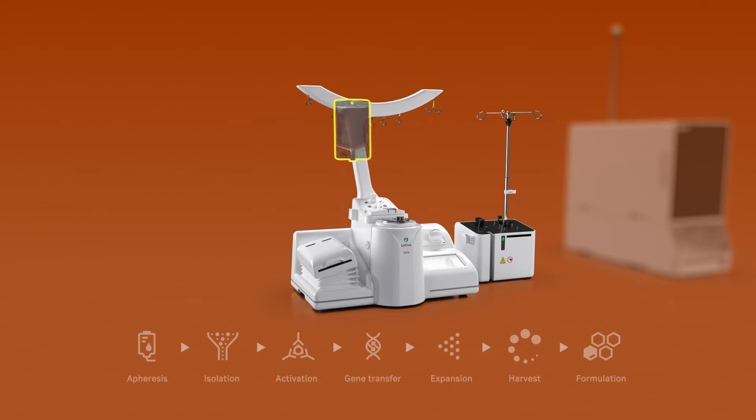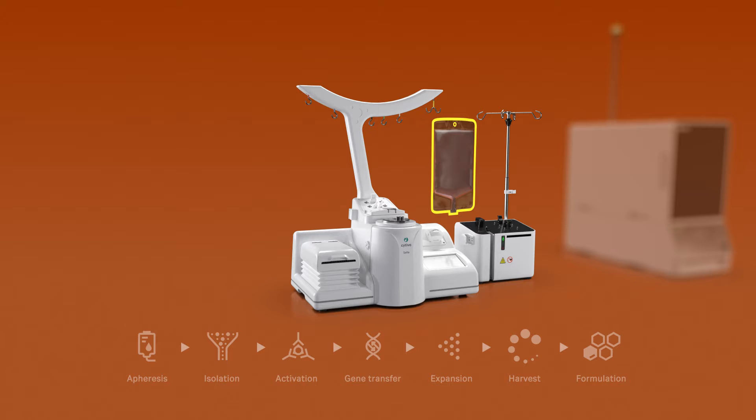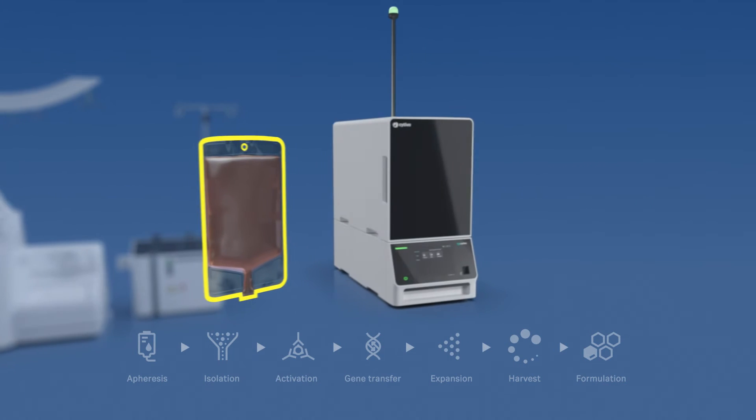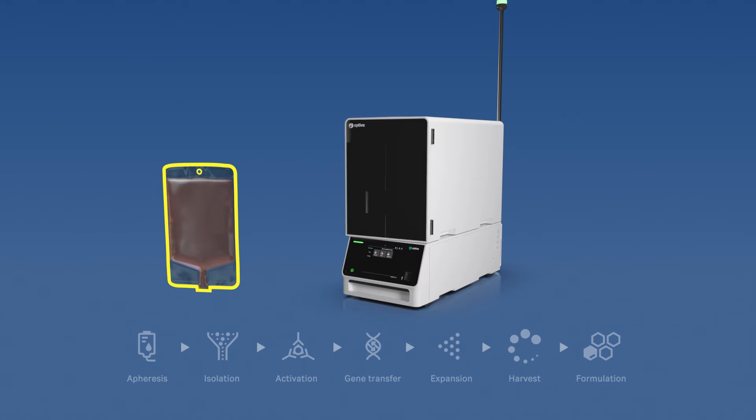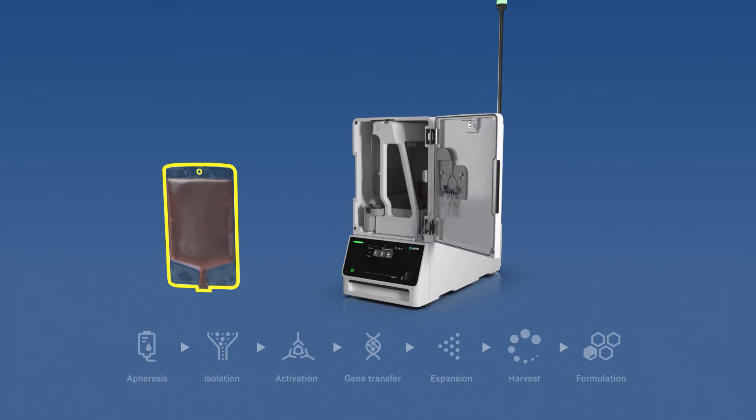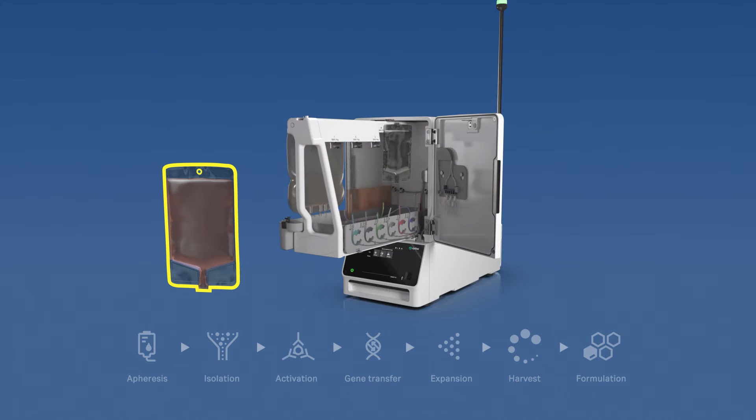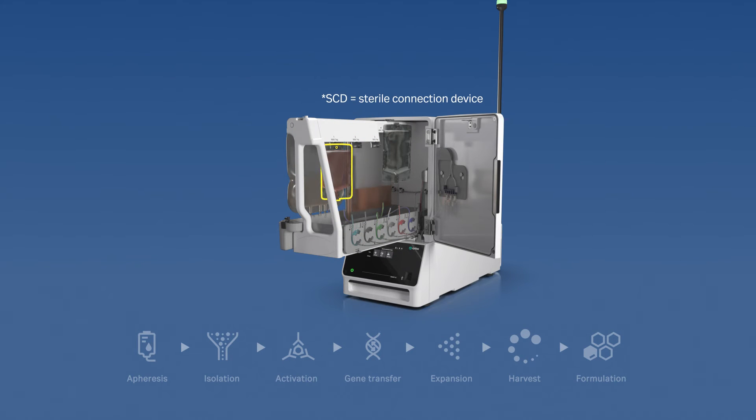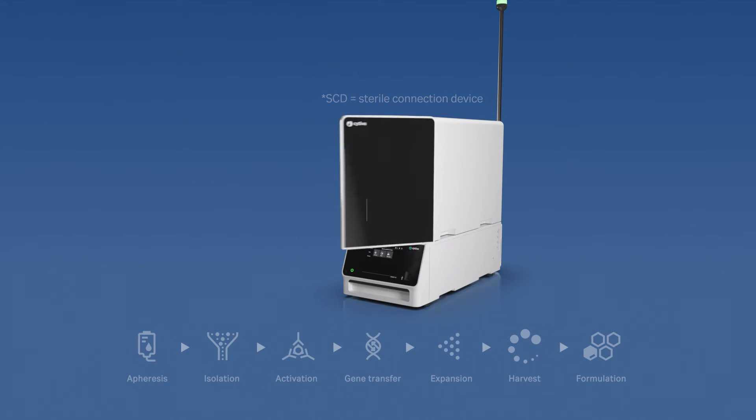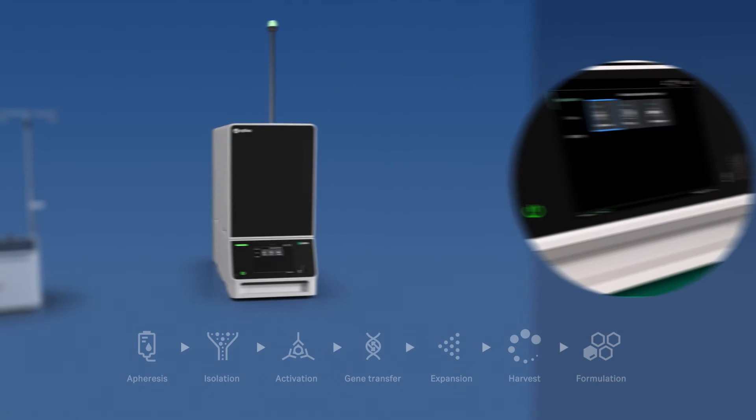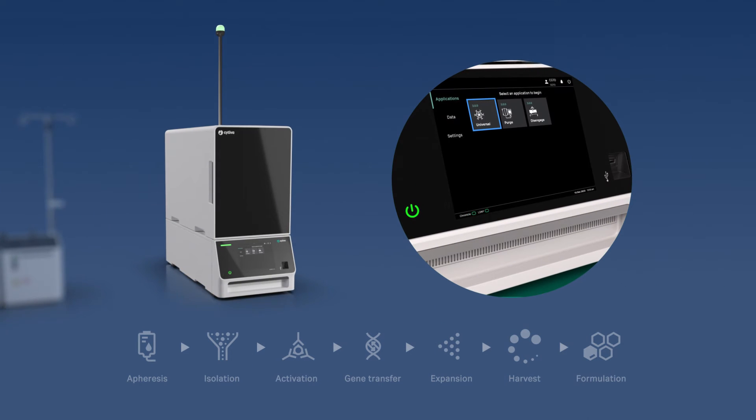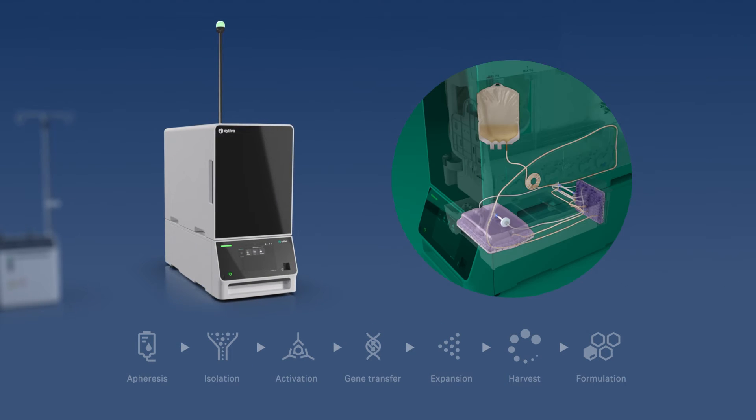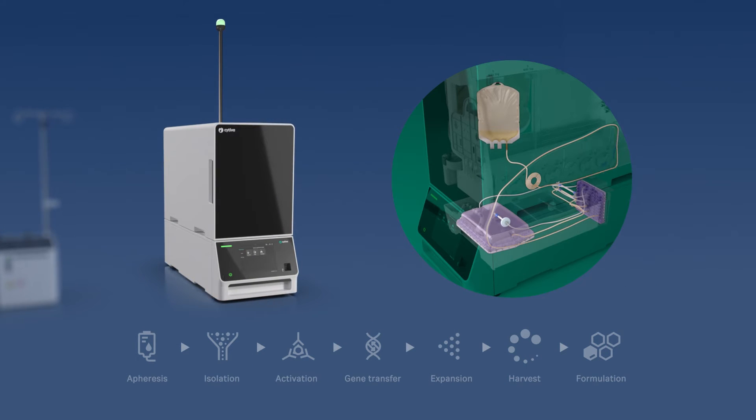At the end of the procedure, take the final bag containing your isolated T cells. This becomes your starting point on Cephia Expansion system. It's as simple as connecting the bag via an SCD to the Cephia Expansion Single-Use Kit and launching the universal procedure.